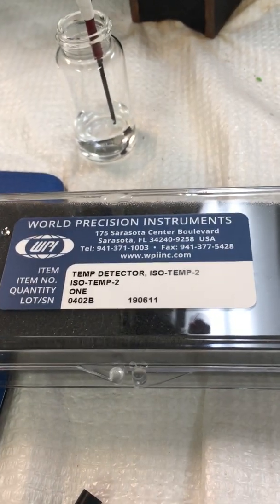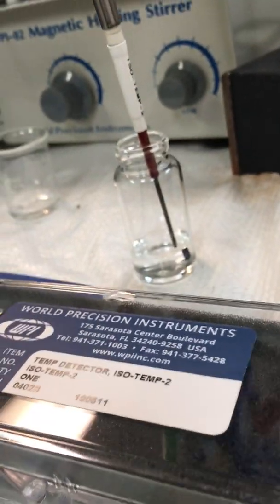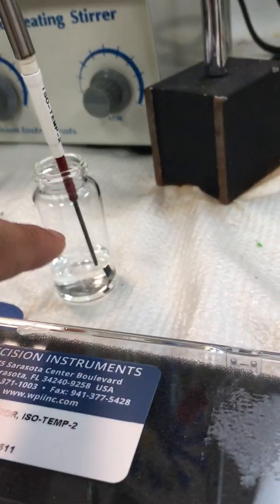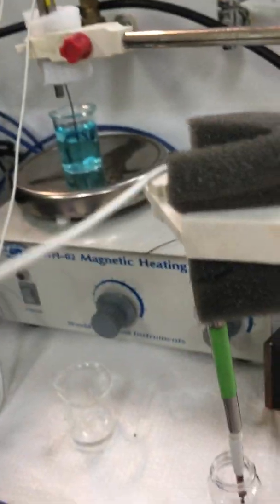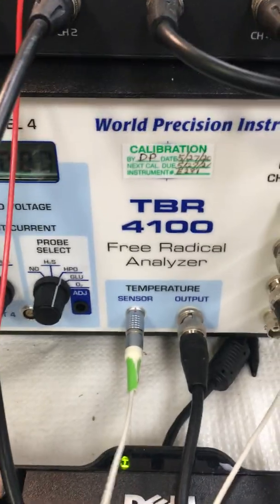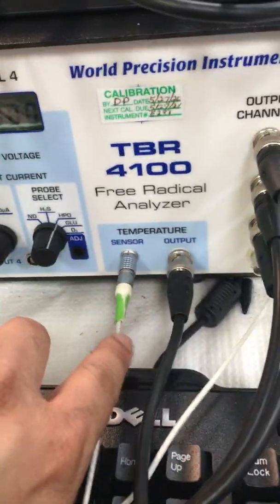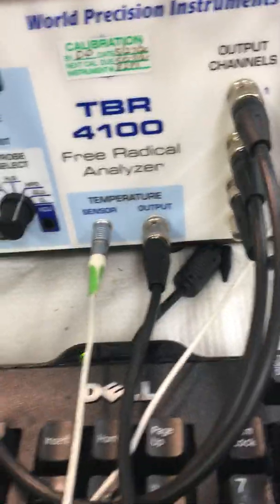So what I have here is the ISO-TEMP-2 temperature sensor, and right now I have the temperature sensor tip immersed in 1x PBS. So it is in 1x PBS. It is connected at the other end with the microsensor cable, and the other end of the temperature sensor is connected over here onto the temperature sensor port.